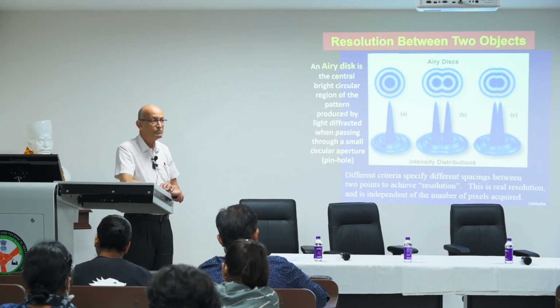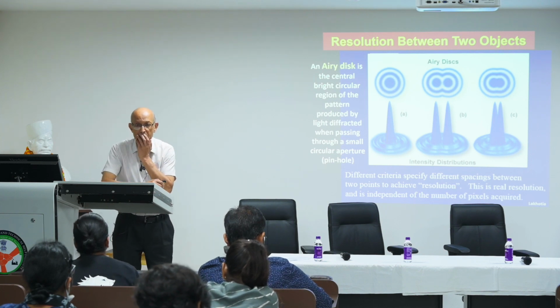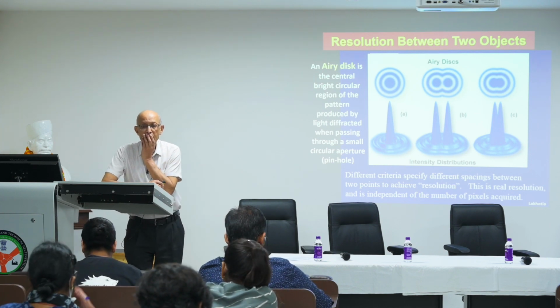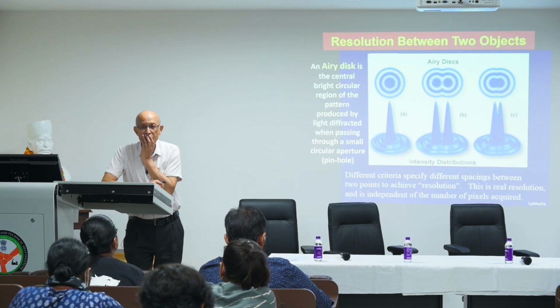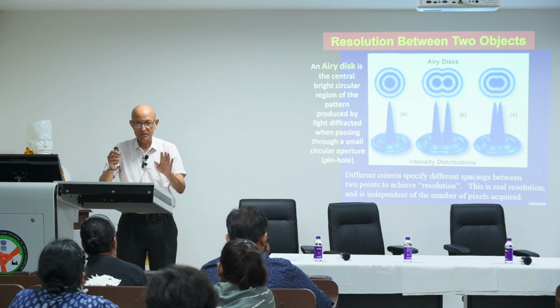Any other question? Sir, you explained the bleed through, right? I just wanted to know about simultaneous, sequential and serial. I think you said simultaneous and serial.